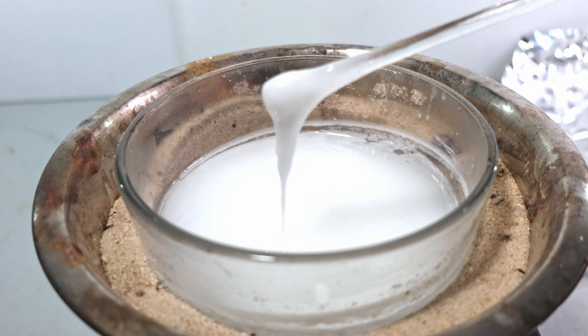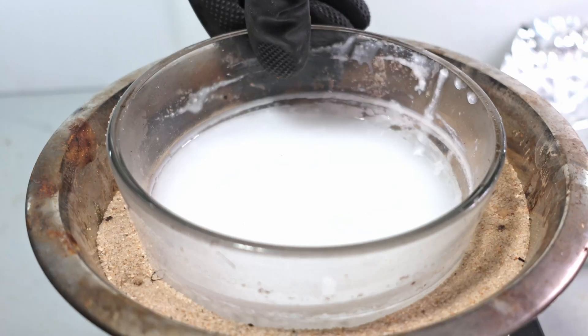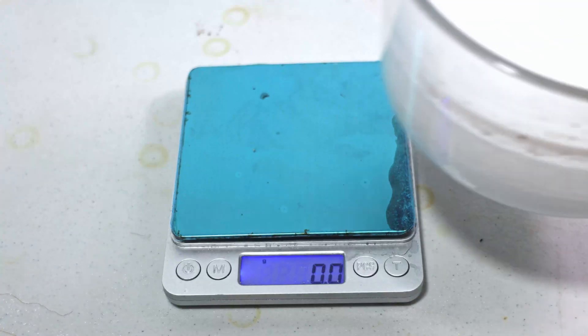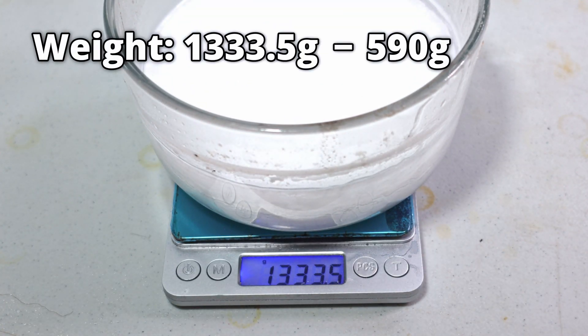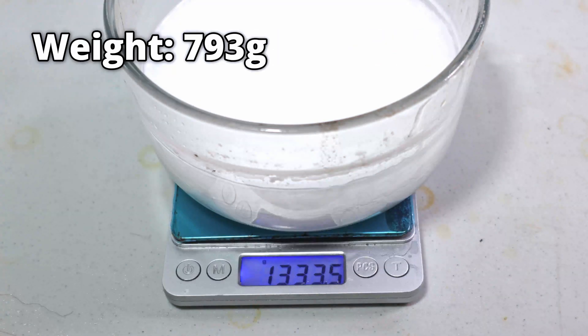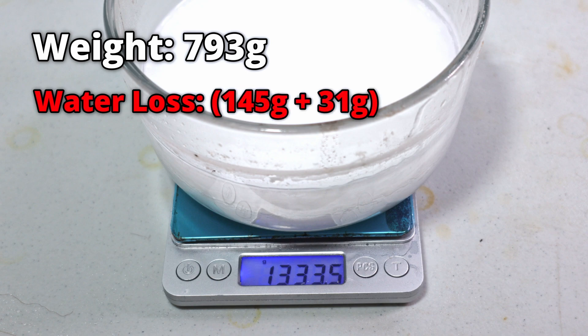When cooled, the polyphosphoric acid is a lot more stiff and paste-like. The only thing left to do is weigh it. The final weight is 1,333.5 grams. Minus the bowl, the total weight of the polyphosphoric acid is 793 grams. This means our acid lost 176 grams of water, 145 of which was free water and the rest as part of the polyphosphoric acid molecules actually condensing.